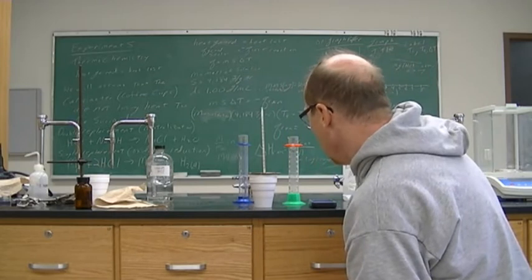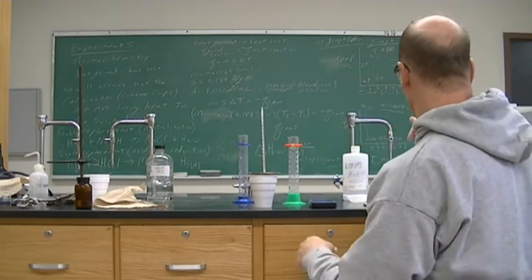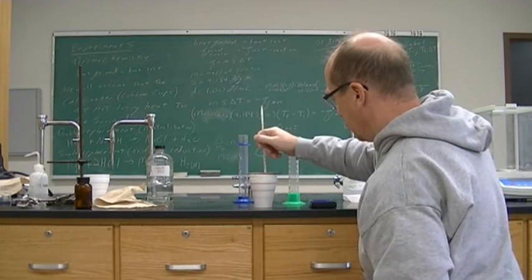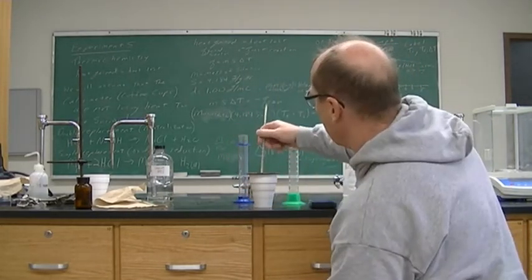And it is still going up. It is not going up near as fast. First one went up 4 degrees. This one only went up 2 degrees. So it's not going up as fast. It's still reacting. I can still hear it.